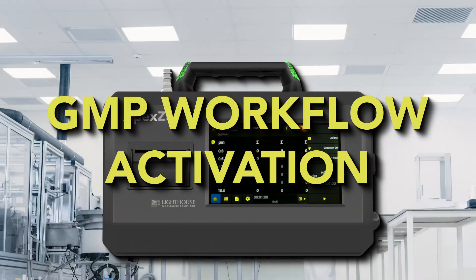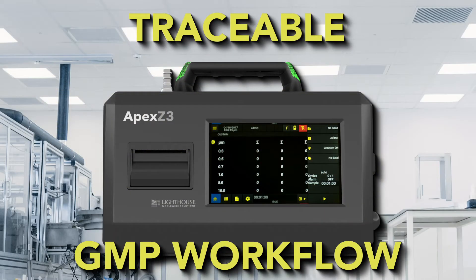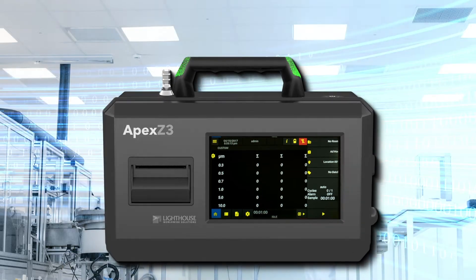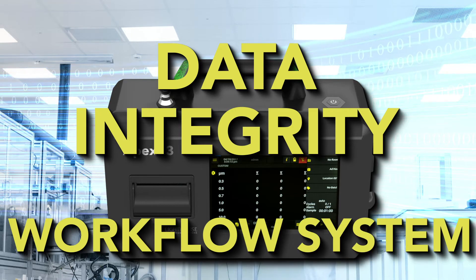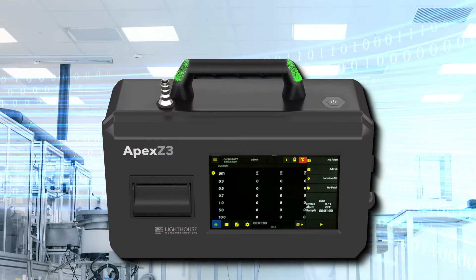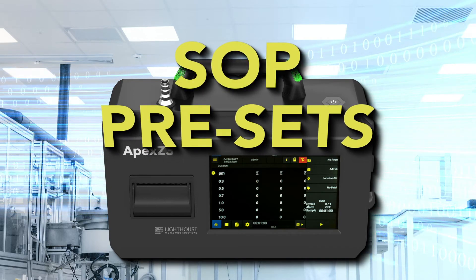The Apex Z particle counter was designed to enable a traceable GMP workflow approach to collecting critical environmental data in your cleanroom. Enhance the data integrity of your cleanroom data with the Apex Z workflow system. Use existing validated SOPs and integrate them into the Apex Z firmware and develop your SOP presets.